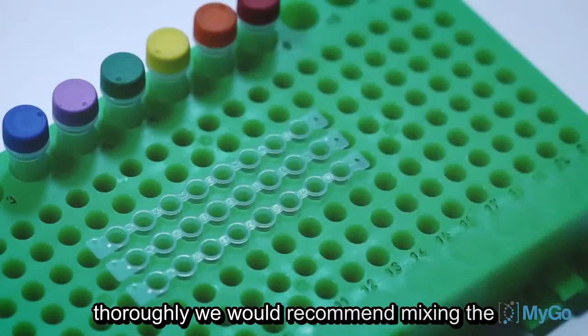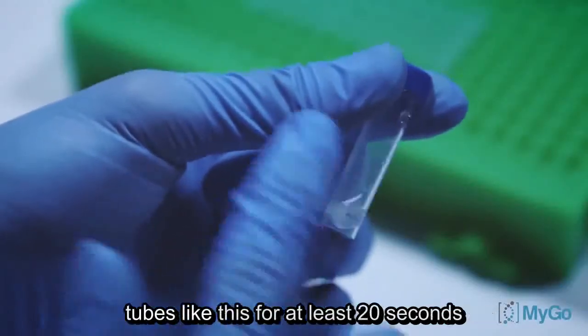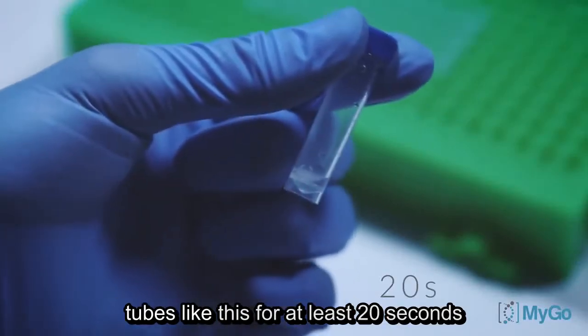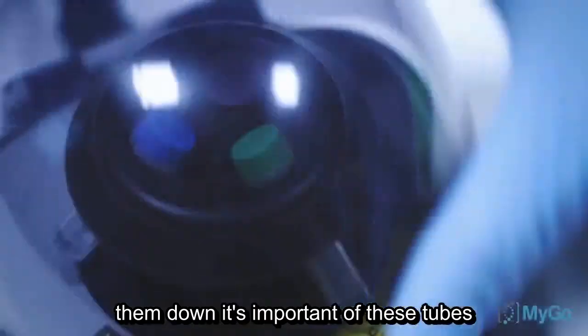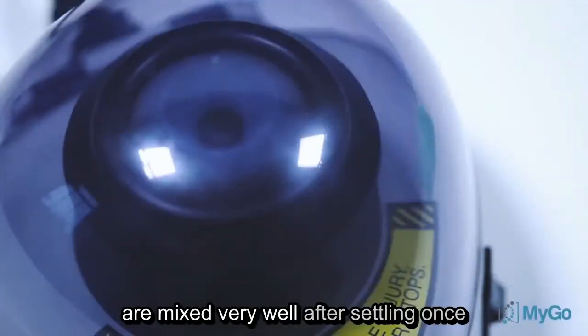Now we'll need to mix the tubes thoroughly. We would recommend mixing the tubes like this for at least 20 seconds, vortexing them, and then centrifuging them down. It's important that these tubes are mixed very well after settling.